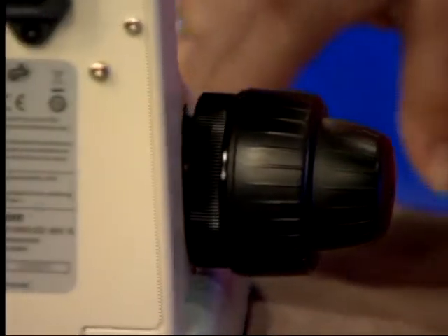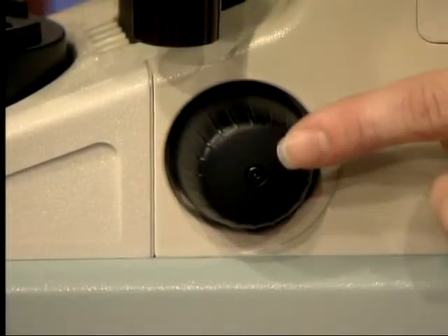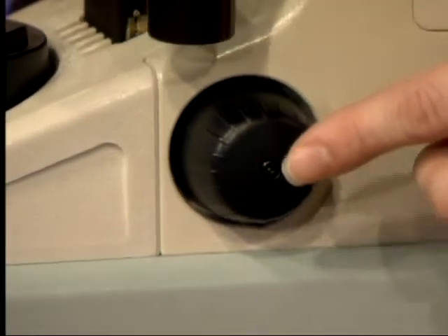On the right side of the microscope we have the fine focus knob. There is no coarse focus on this side — just the fine focus.